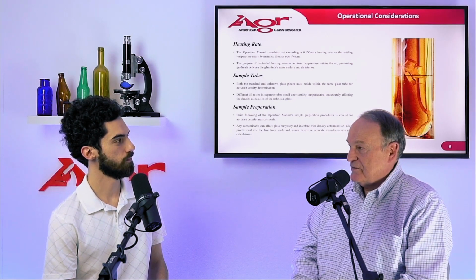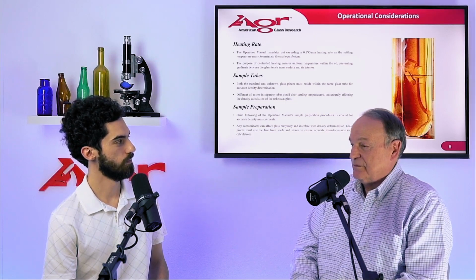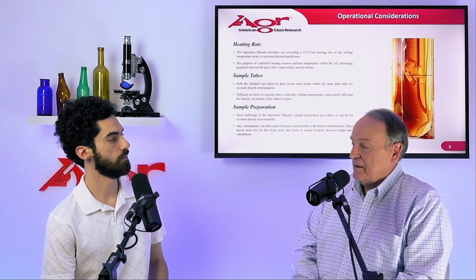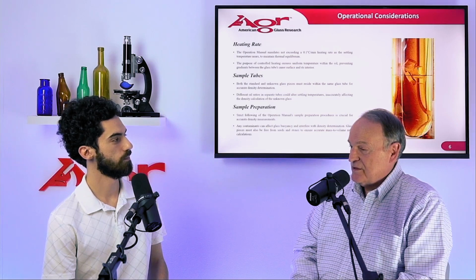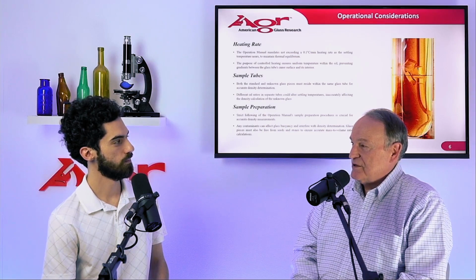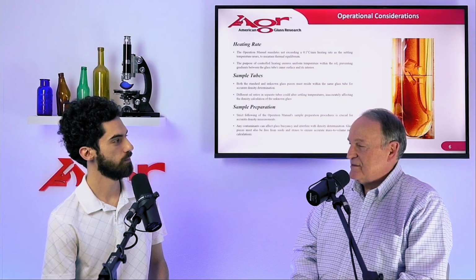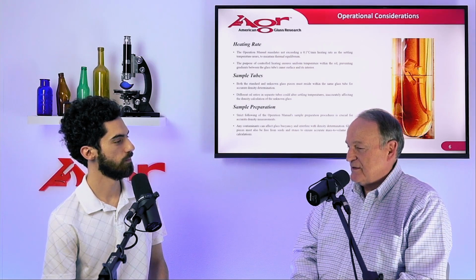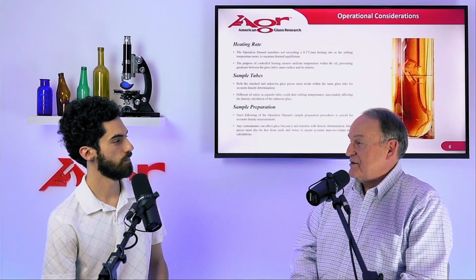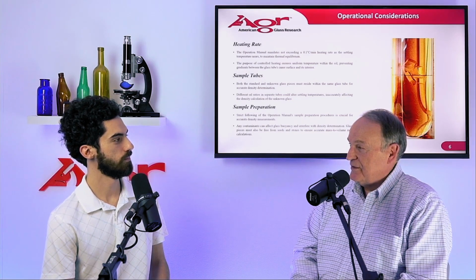Any contaminants such as fingerprints or mold dope or just ordinary greases from lying around in the laboratory can contaminate these oils. And the problem here is not so much that it will upset the coefficient of density change as much as it darkens the oil. A big issue is water. When you clean these items, and if you use something that's fairly warm, when you set the pieces out to dry and it's a humid environment, a very, very thin layer of water can condense on the samples.